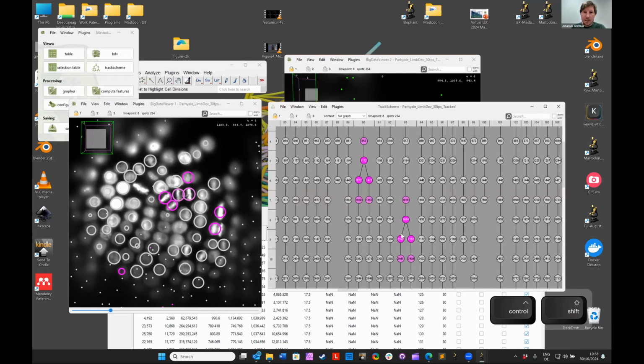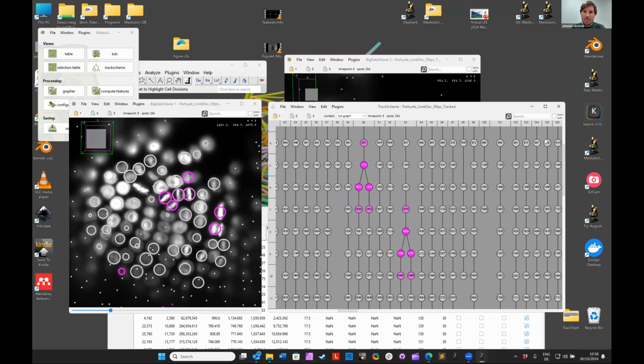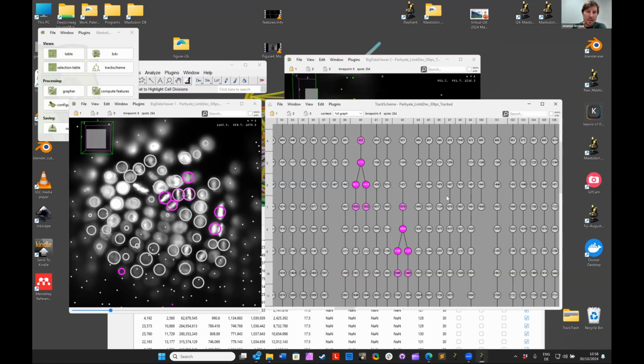Yeah, I think at that point, I'm more or less finished. And I think I will now hand over to Stefan, who will show you, starting exactly where we are now, with these tracks, how you can further analyze them. And so I will stop sharing now. But maybe before I stop sharing, I will check if there are any questions from the chat. But yeah, there was just one question.